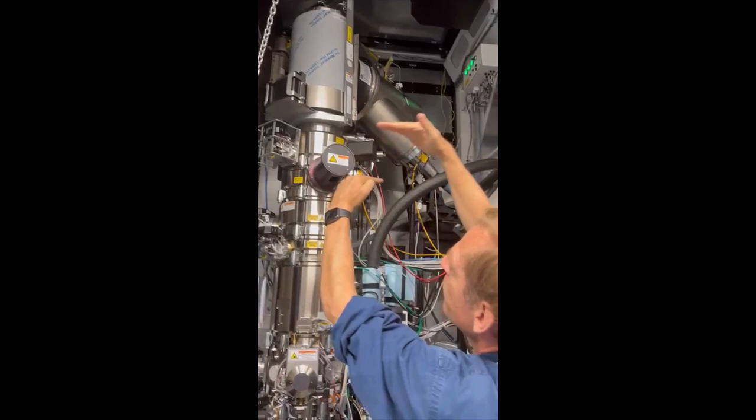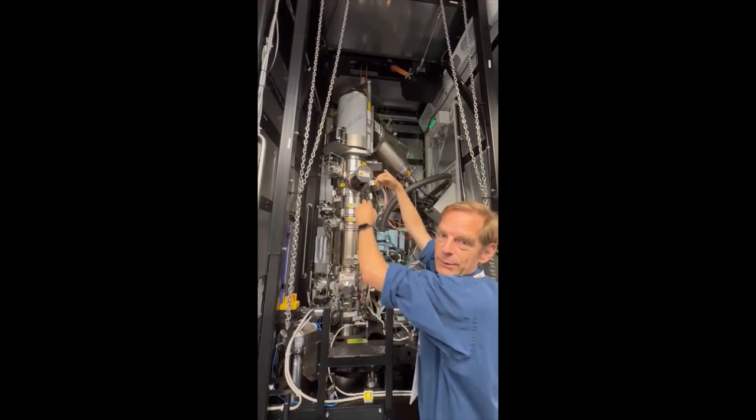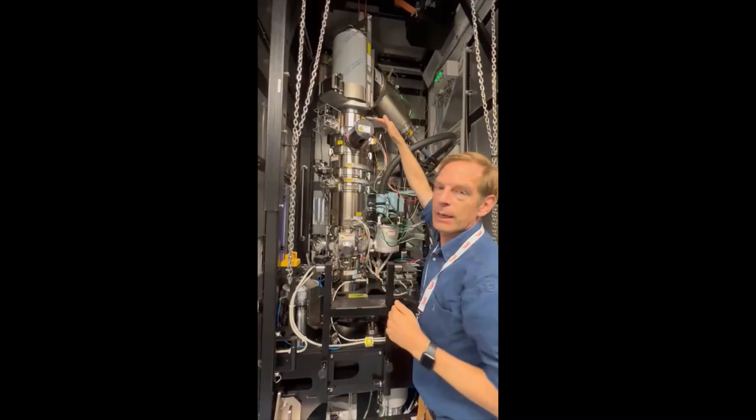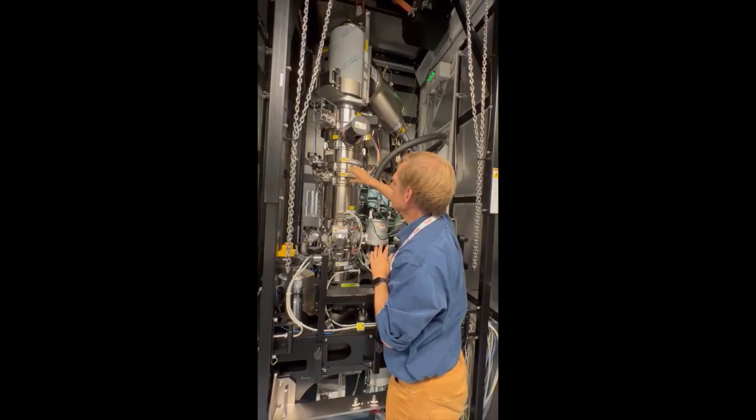The electrons sit there and then you have 300,000 volts. Electrons are negative and they don't like negative, they want to go to the positive. So the rest of the microscope is at ground potential and the top is at minus 300,000 volts, so the electrons start flying down. They go to half light speed and fly down in the middle of this vacuum.